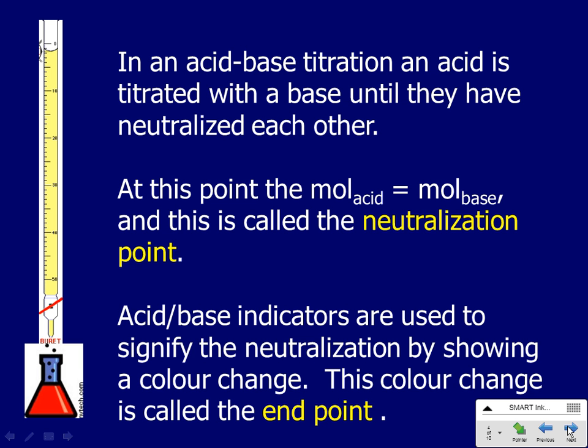But potassium permanganate is a very purple color. And as you mix it with the thing that it's reacting, once you get to the point where the moles are equal, that purple disappears. And it goes from being very purple, within a drop or two, disappears. So we could use the same technique, except it had nothing to do with acids and bases. So it doesn't matter, it doesn't have to be acids and bases. We sometimes, as young chemists, associate the word titration with just acids and bases, but it can be with other chemicals.